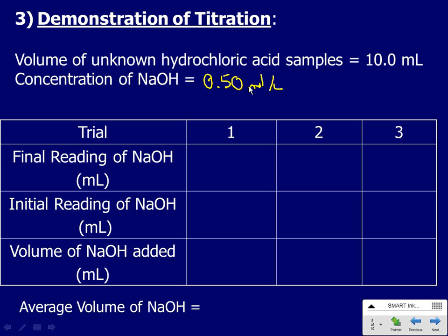Preparing the burette. We need the interior of this device to be coated with the same material that we want to titrate. So we want to make sure that we don't affect the concentration of the base that we know to be 0.5 molar. So with the little tap closed, I take the base, and using the lip of that beaker, I just carefully pour in about 20 mils. Now notice I'm keeping an eye there. I'm not looking down, and that's about 20 mils, 15 mils.